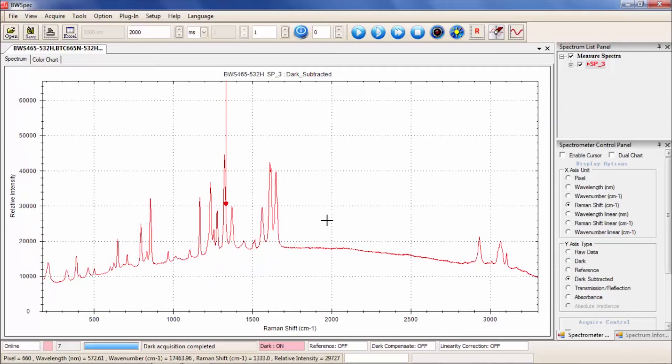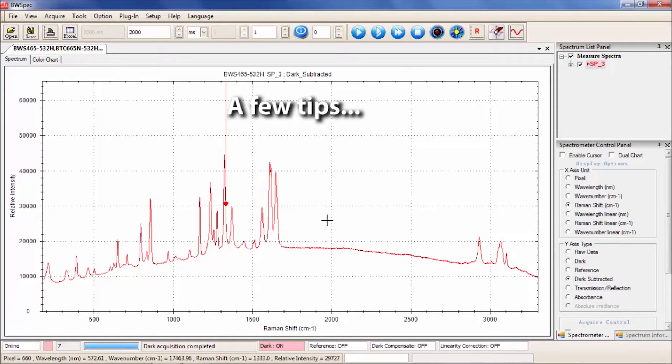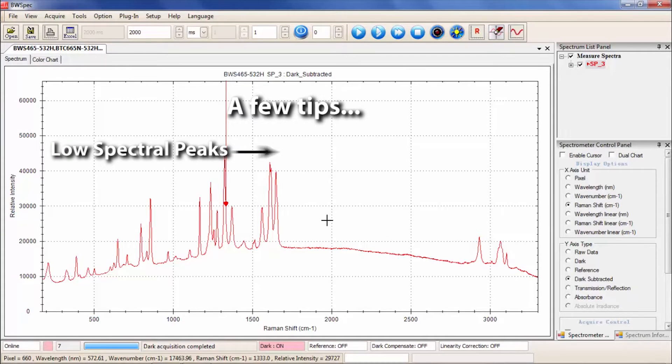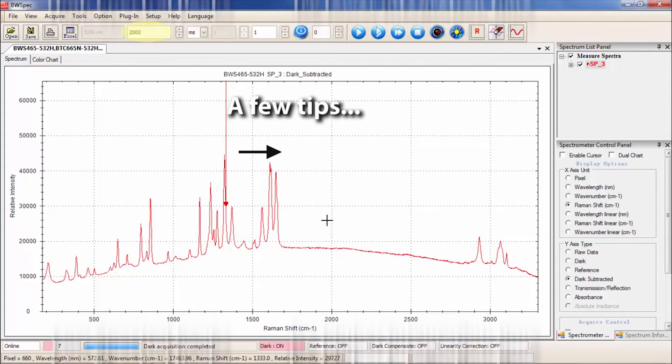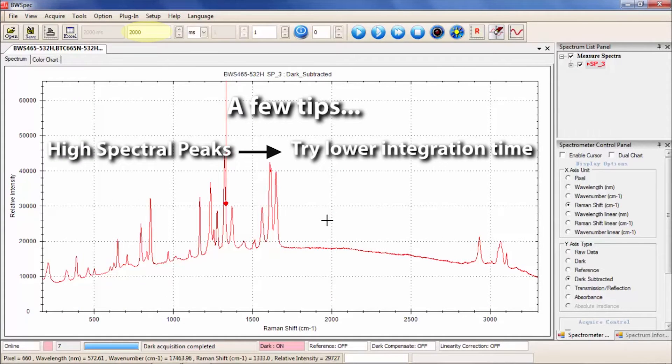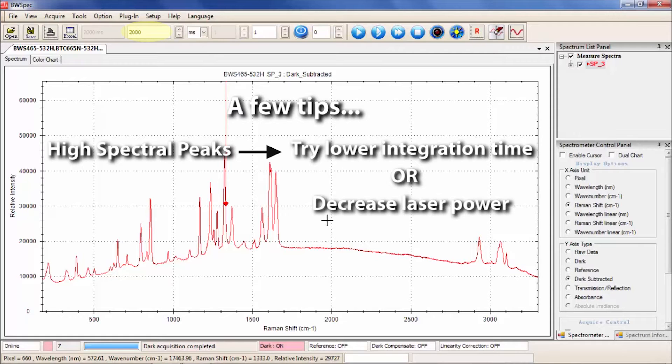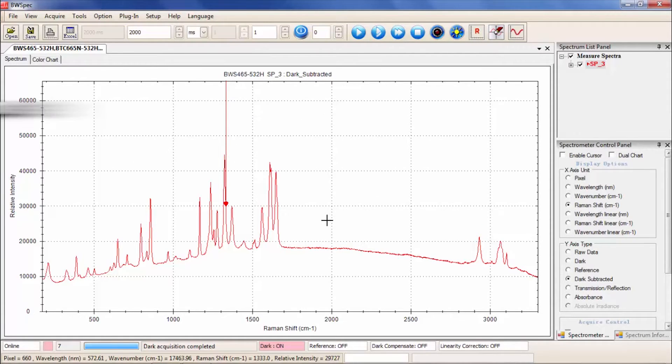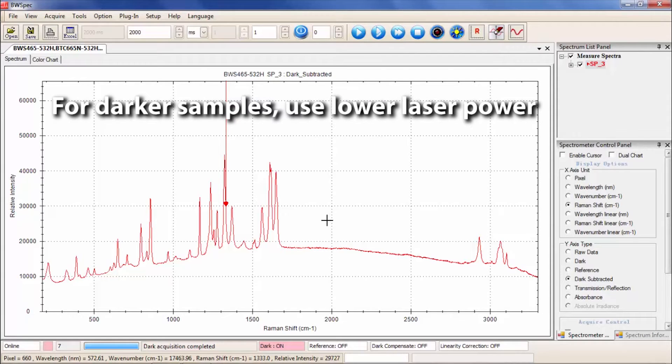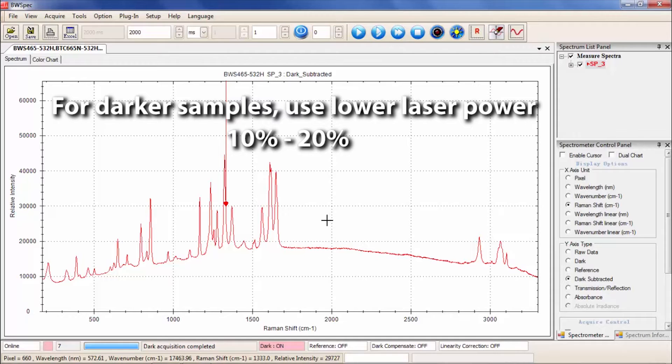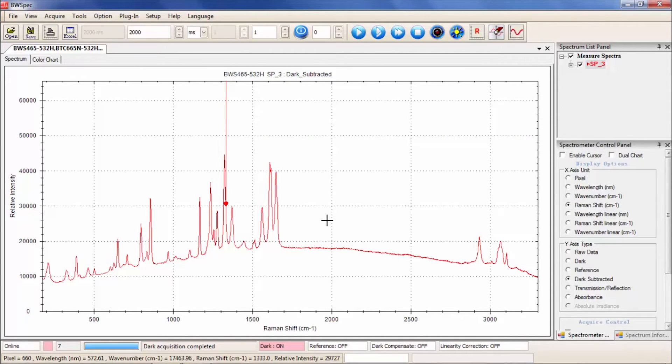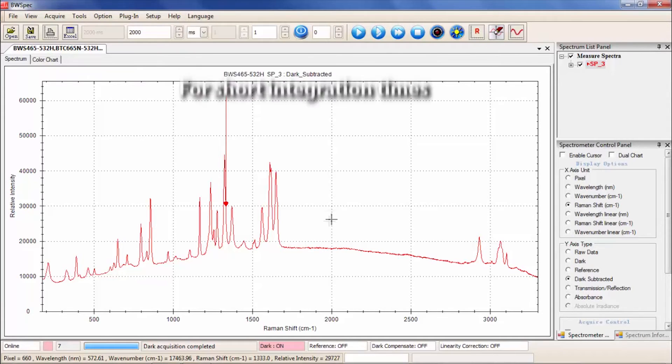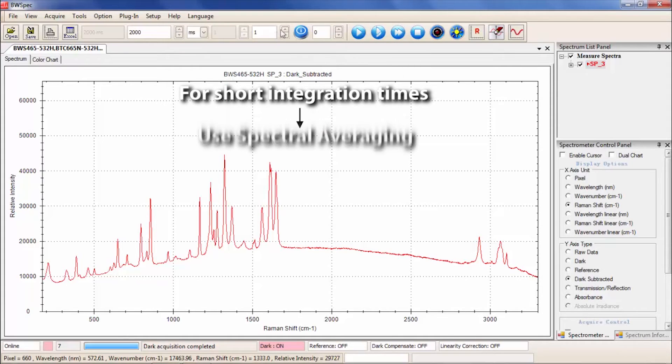Here are some tips for using your spectrometer for the first time. If your spectral peaks are low, try increasing your integration time. If your spectral peaks are high, try lowering your integration time or decreasing your laser output percentage. If your sample is made of dark materials, try using a low laser power setting of around 10-20%, as dark materials may burn at higher laser power. For short integration times, it may be beneficial to use spectral averaging to improve the signal-to-noise ratio.